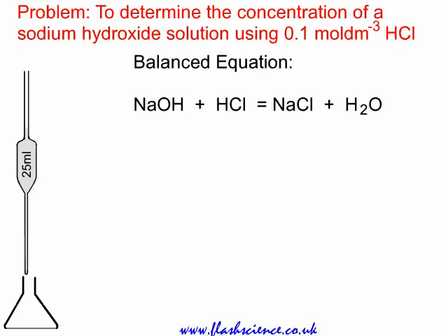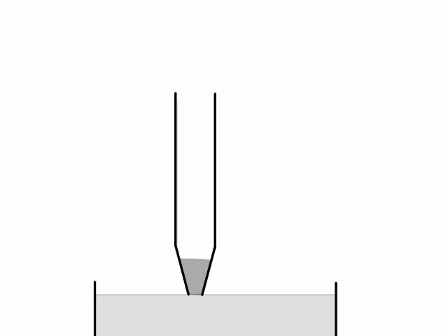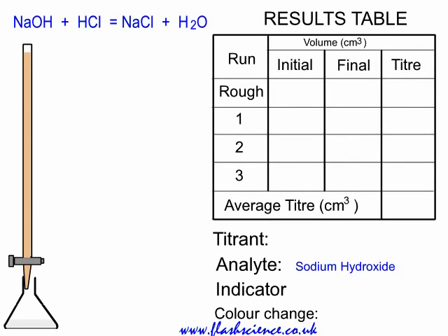We take a bulk pipette, typically 25 cubic centimetres or 25 mils. You see the liquid being run out — not blown out, just run out under gravity into the flask. There will be a little bit left at the bottom of the bulk pipette. By touching the surface of the liquid in the flask, capillary action withdraws roughly half of that. The remaining amount is accounted for during calibration of the bulk pipette.